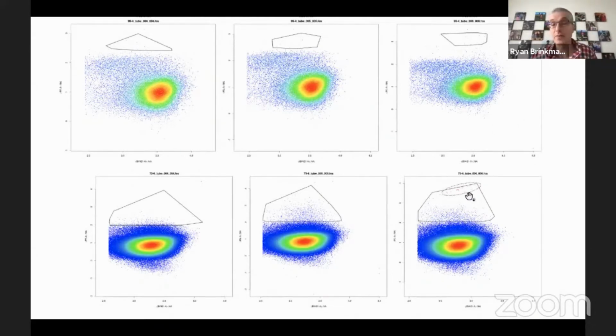And then when it's there, we can pull it out. And this was a really hard population to gate. I don't think an unsupervised algorithm could ever do that. I could be wrong. I have perhaps reinforcement bias because we've seen this being used.